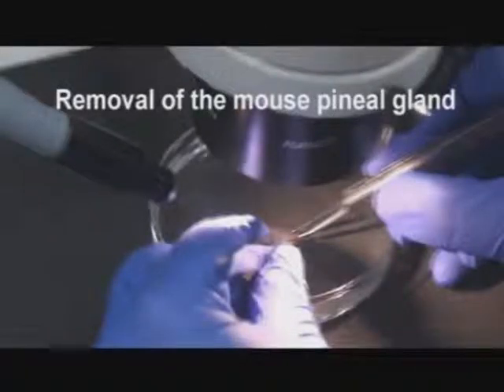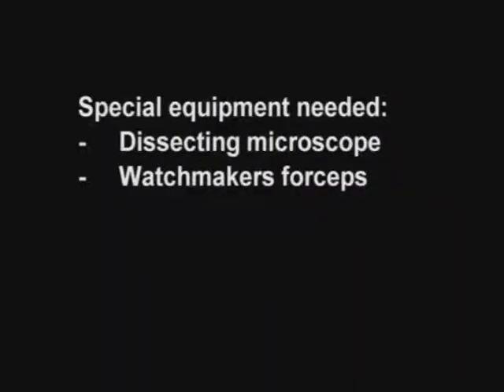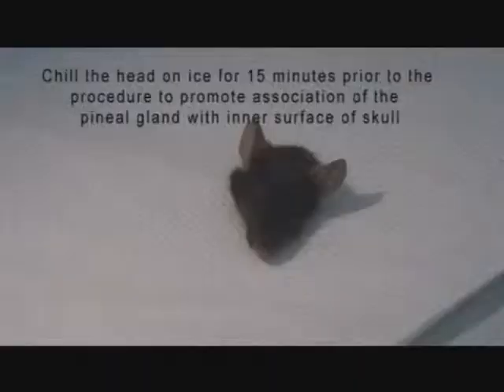This is a training film about how to remove the mouse pineal gland. As you can see here, you'll need some special equipment, which is the dissecting microscope and watchmaker's forceps.